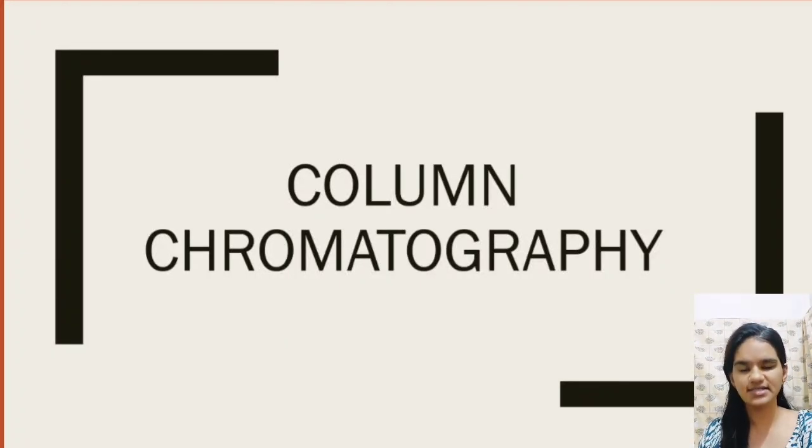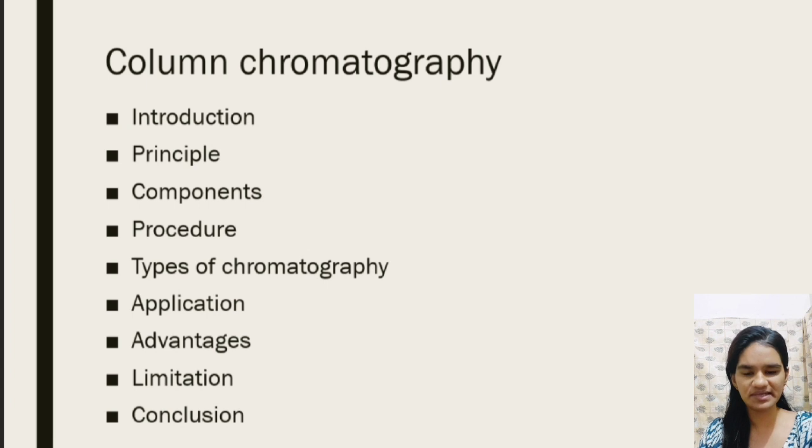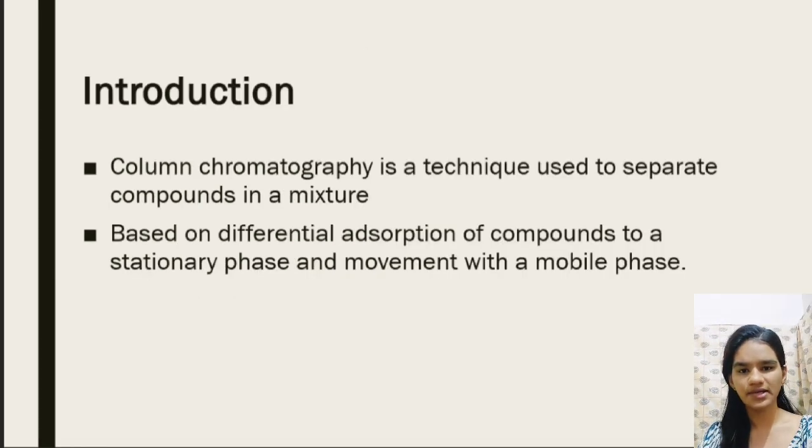I am currently studying in JC's College, Ooty Road, Mysore, and today I am here to give a presentation on the topic column chromatography. In this topic we will mainly see the principle, the components we will use, how the procedure will take place, and the advantages, applications and limitations of column chromatography. Now let's look into the topic column chromatography.